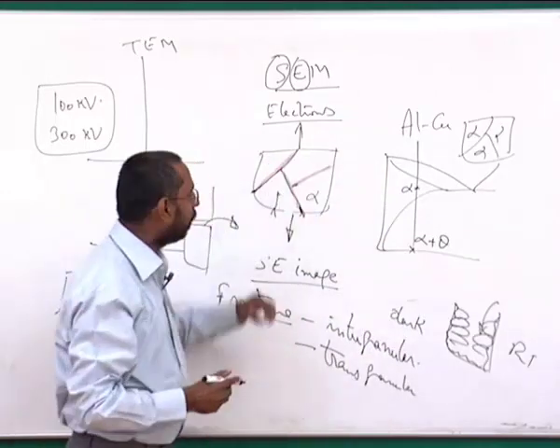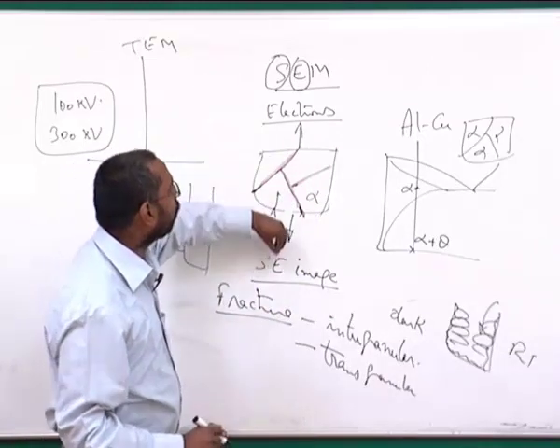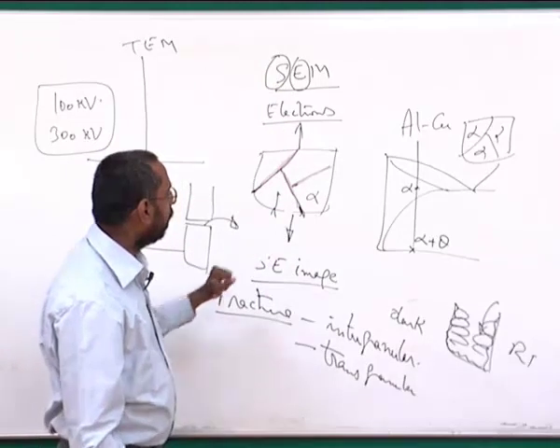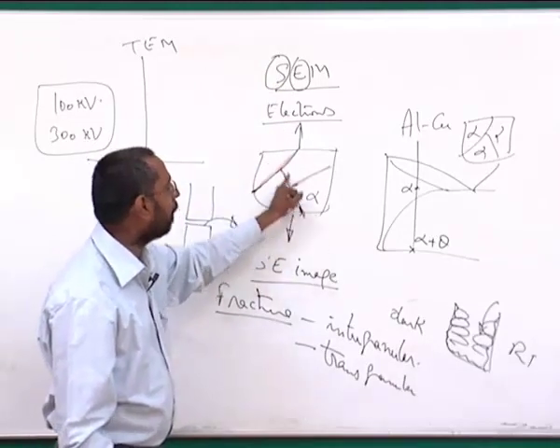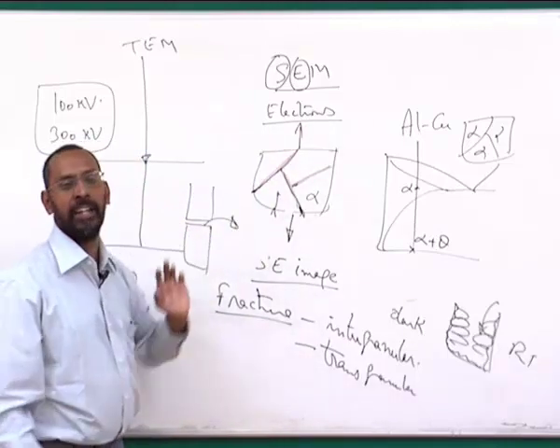and the theta decorates the whole grain boundaries as a thin layer. Because of that, when you subject this material to tension, whenever a crack is nucleated, instead of trying to propagate through the grain, it prefers to propagate through the grain boundaries, because the grain boundaries have a brittle region where the crack can easily propagate.